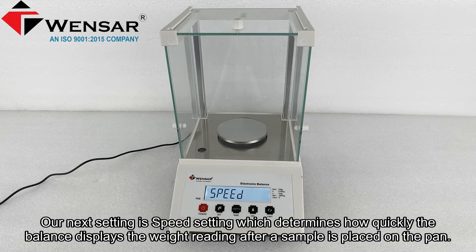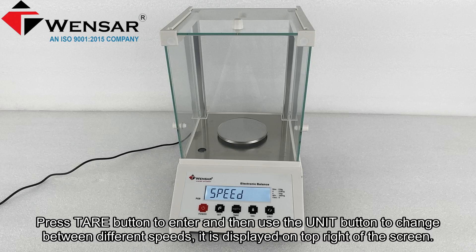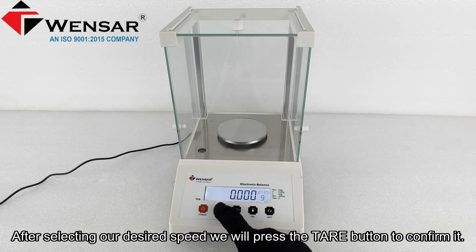Our next setting is the speed setting, which determines how quickly the balance displays the weight reading after a sample is placed on the pan. Press the tare button to enter, then use the units button to change between different speeds, displayed in the top right of the screen. After selecting the desired speed, press the tare button to confirm it.